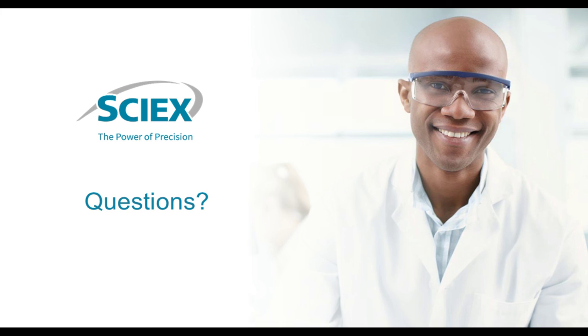Thank you. Will 32 Karat still be required for the field technicians to qualify the instrument or to do troubleshooting? That's a good question. For the Empower operation qualifications, we will be integrating the Empower. The 32 Karat will still be needed. Our service engineer will be equipped with a service tool, and they will carry the 32 Karat on their laptop. And this service tool has been calibrated. The other reason is we still need the 32 Karat for calibrating some of the components in the PA800 Plus.